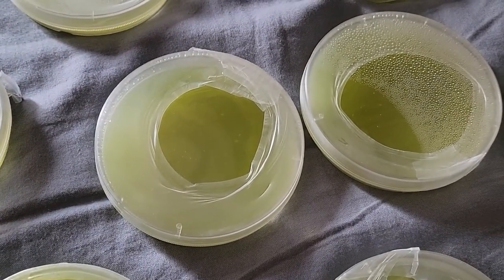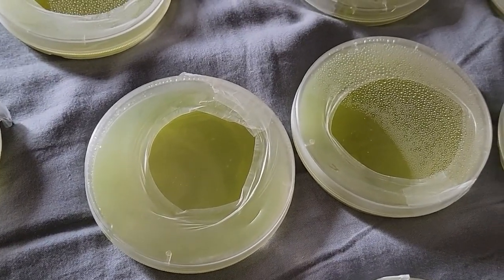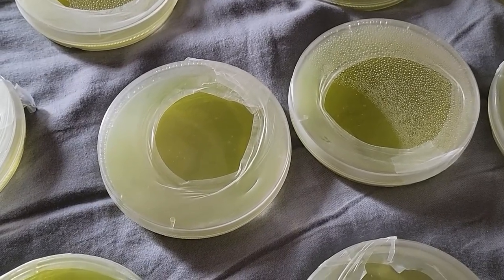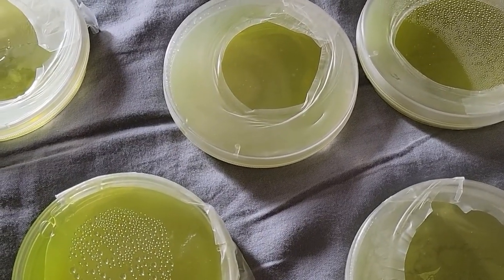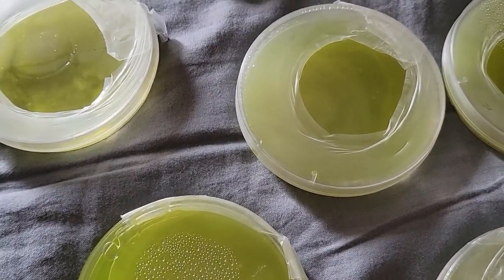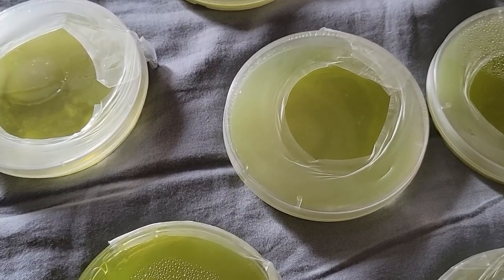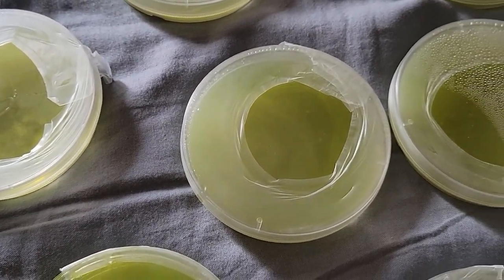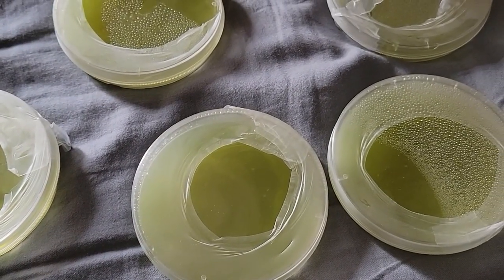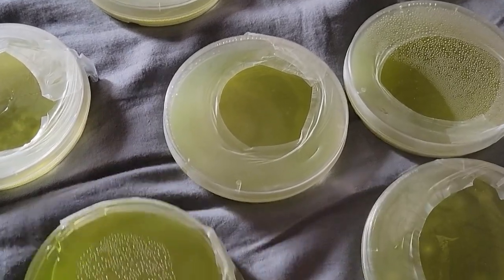So next time I gotta make sure to find a better heating source for the pressure cooker, because I put it on the hot plate and the heating would come on and off, so I was never able to build pressure. I was never even able to pressure cook it. It never got up to any kind of pressure, so I ended up just steam sterilizing it on and off for about 30 minutes, which probably had to do with this contamination.